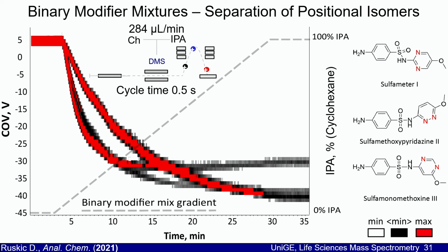And then at that point it was clear to me why SCIEX didn't allow me to work below 1.5%, because this is what gives the most accuracy with a peristaltic pump. Here, if you change the composition a bit, you will have high variability. So you really need to make sure that you have a stable flow of modifier.